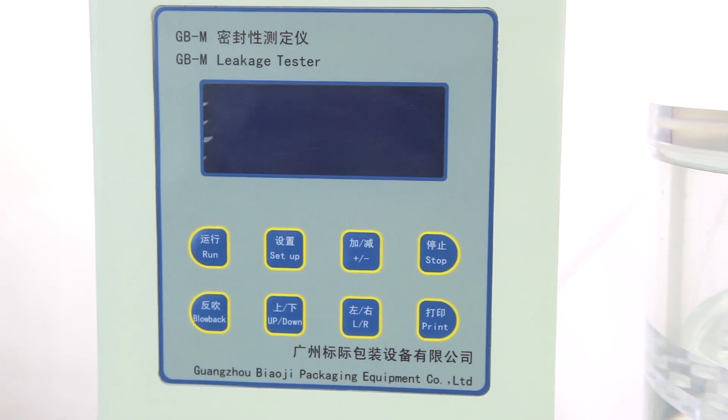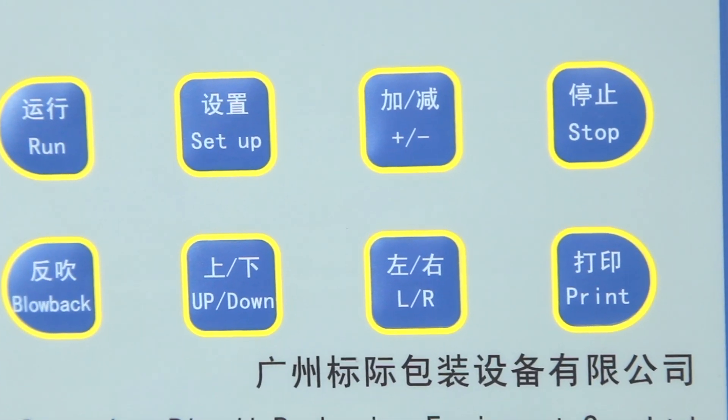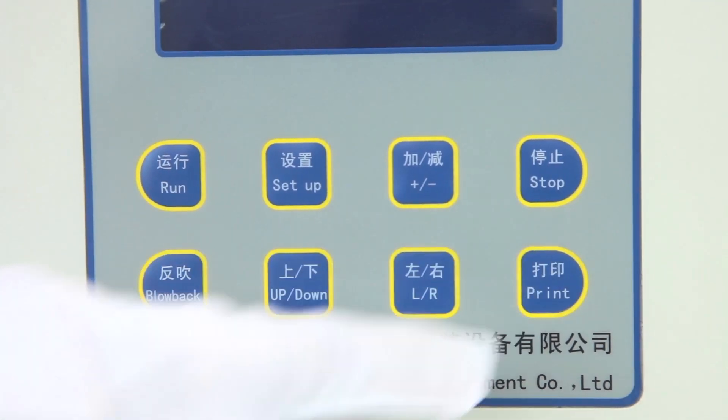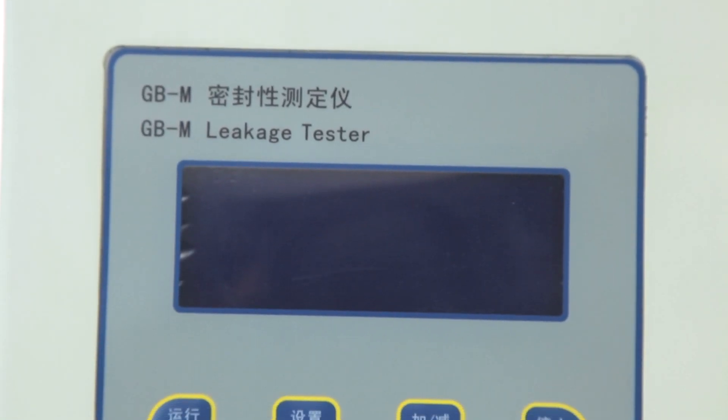GBM1 has high precision, can set vacuum keeping time and pressure, easy to use, automatic stop, automatic return, can print report, LCD display, can set date, excellent appearance design, practical and high performance.